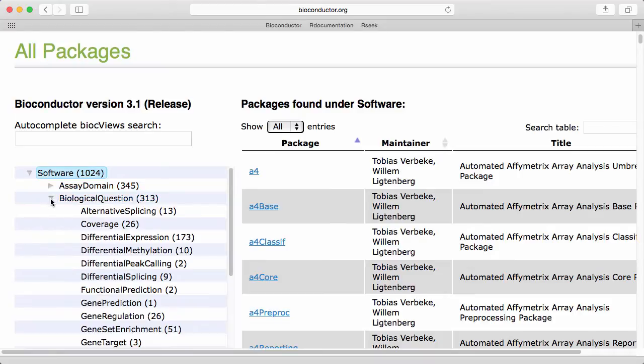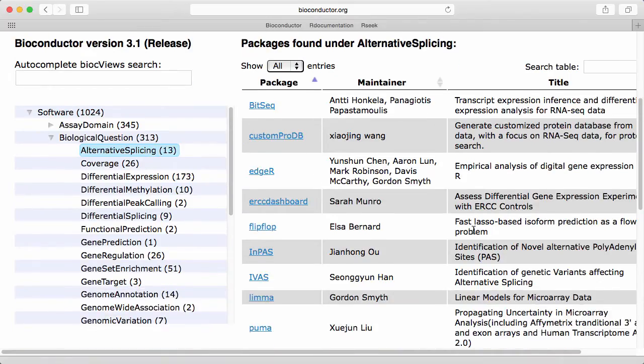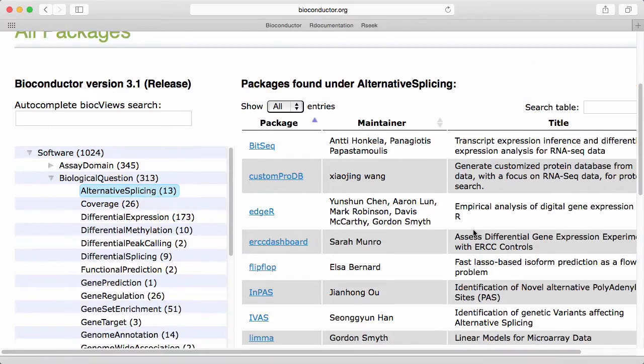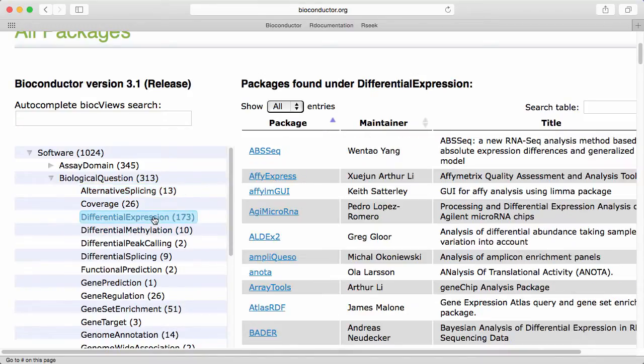For example, if we expand the biological question we can see that there's 13 packages where the authors have decided that they deal with alternative splicing and there are 173 packages dealing with differential expression.